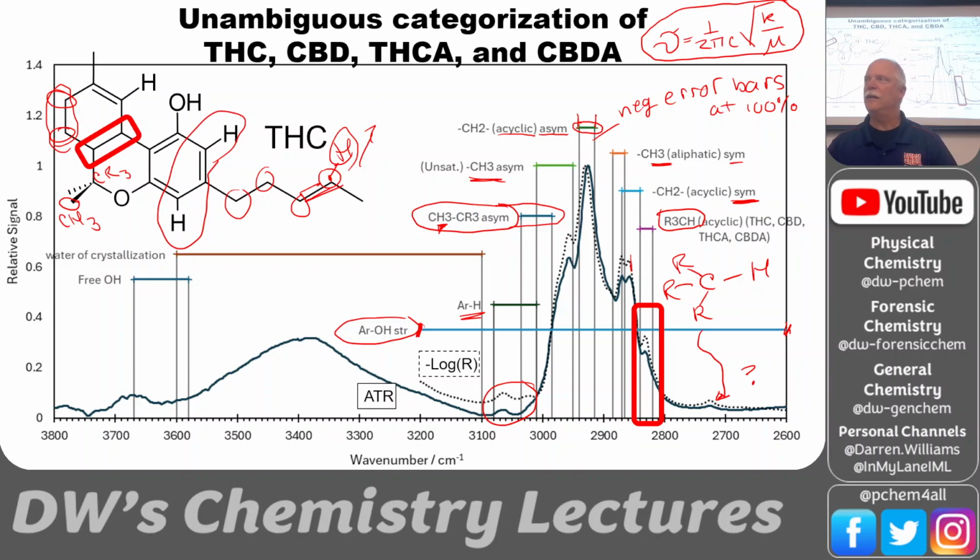Make sense? Yes. In all of the data that this book used to come up with its tables, it found OH stretches somewhere along that whole range.